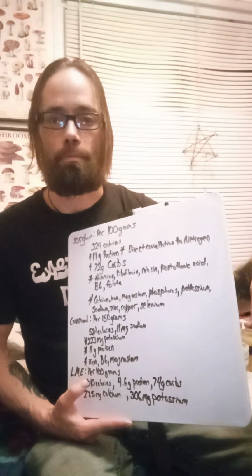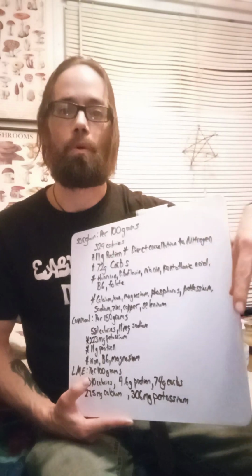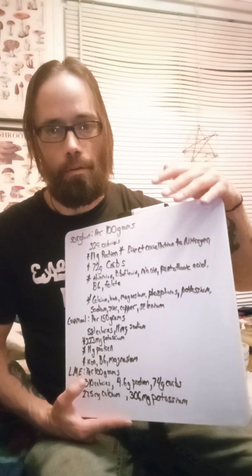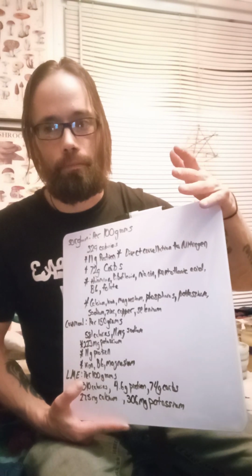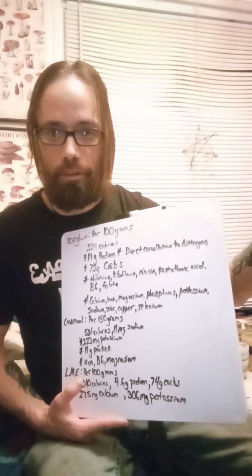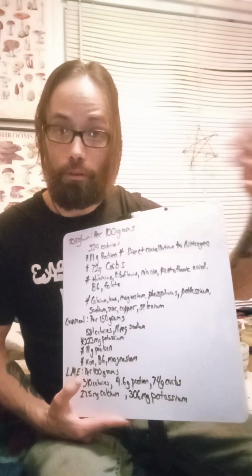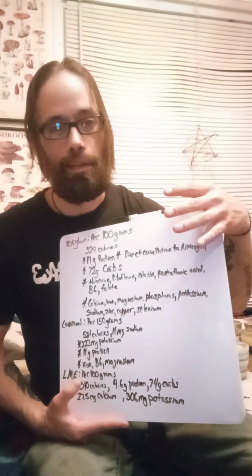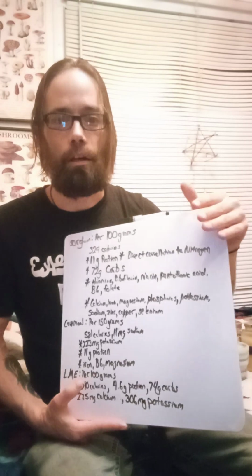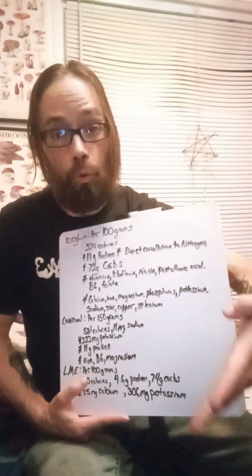Like when you're formulating your media, what has this mycelium been on? What has it not been introduced to? Or how much, and things like that when you go managing your cultures. Also, do you want a sugar diabetic culture that starts to mutate as you go out? If you're going back to spore often, it doesn't matter. Who cares? You grow it on honey, or you experiment with different medias. You find out what you like.